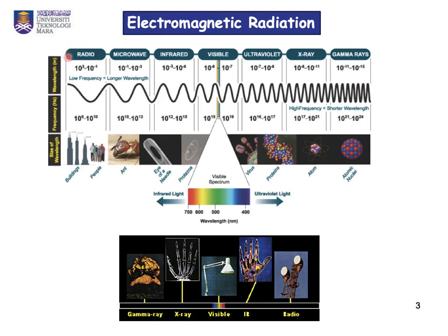The radiation on the left hand side, for example the microwave or radio waves or radio frequency, is the type of radiation that concerns us in NMR spectroscopy.